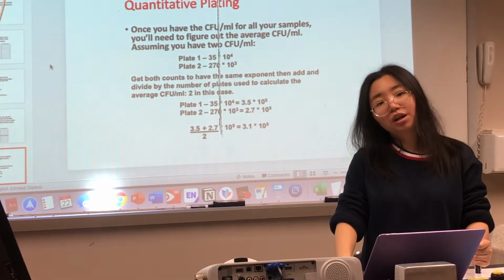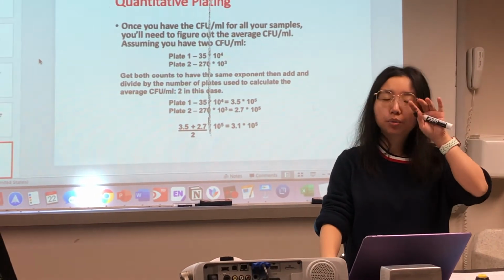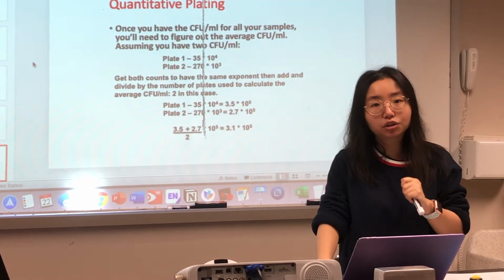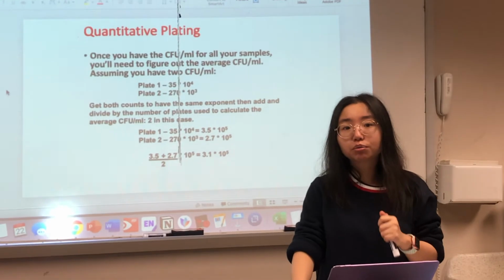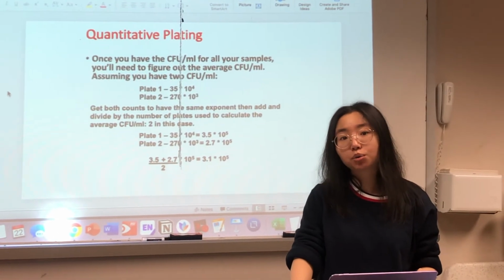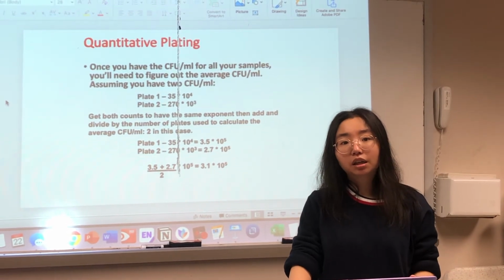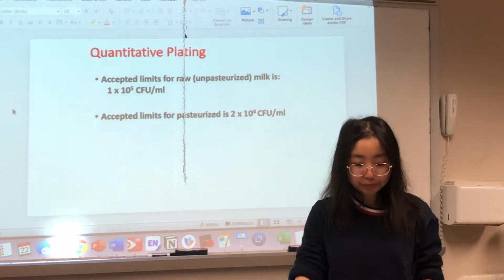I assume you understand how to do the calculations because we are going to have quiz questions related to the calculation shown here. And our lab report also requires you to understand how to do the calculation of CFU per ml. If you have any questions, please let us know.